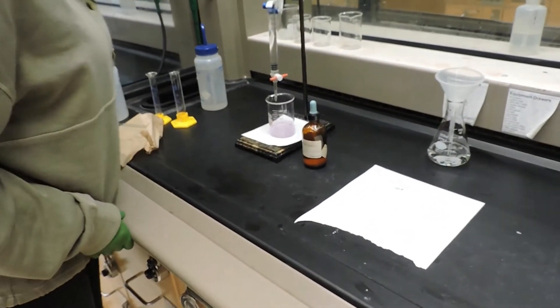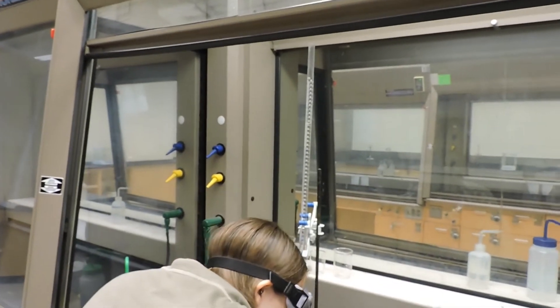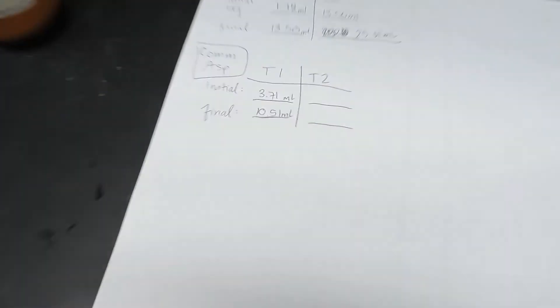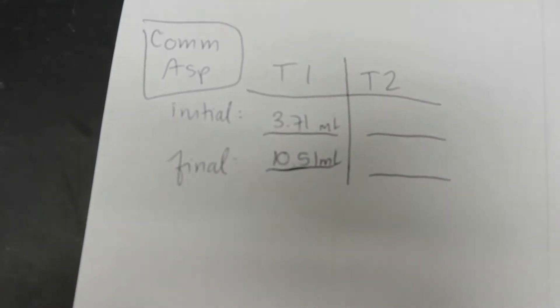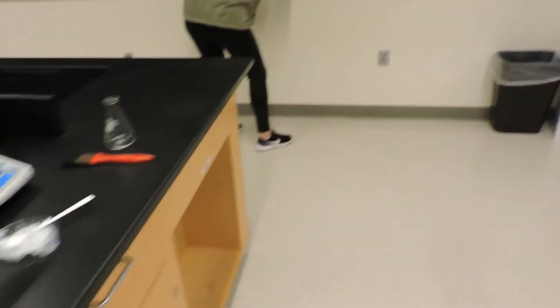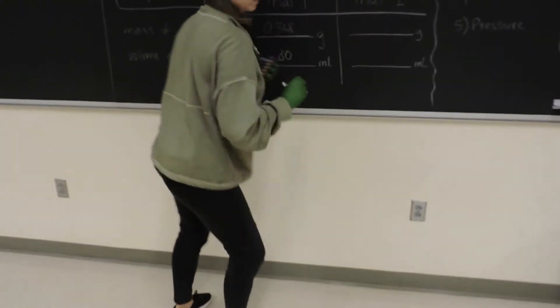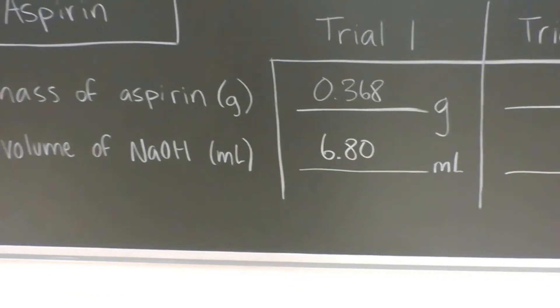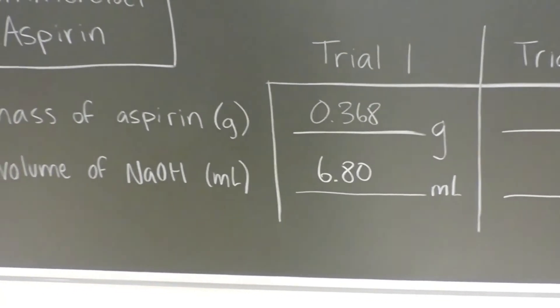The solution is now a light pink — the endpoint has been reached. The final volume of our sodium hydroxide solution in the burette is 10.51 milliliters. The difference between the final and initial volume gives us the total sodium hydroxide volume used, which equates to 6.80 milliliters for trial one.